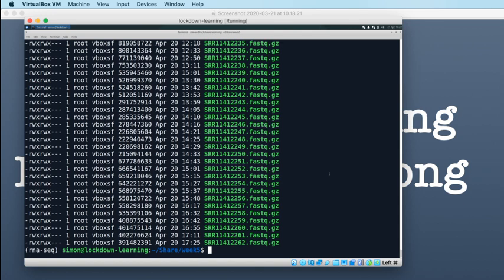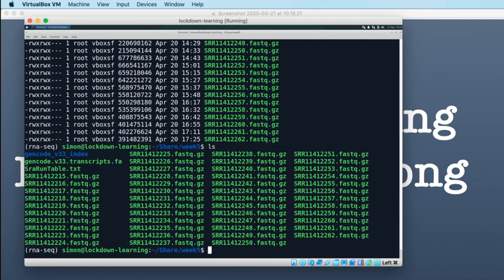After the lesson, I'll put the file sizes in bytes and the SHA-256 sums of the files up on GitHub along with today's script, and people can check that their data is the same as my data. But what we want to do now is move on to today's script. The first thing that I want is some input. What we need to think about is we've got these 48 files, but they represent 12 samples.